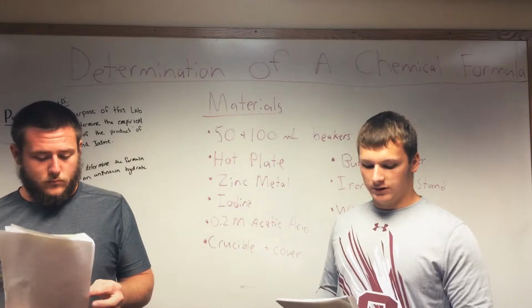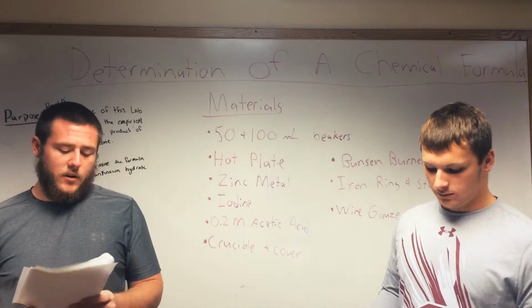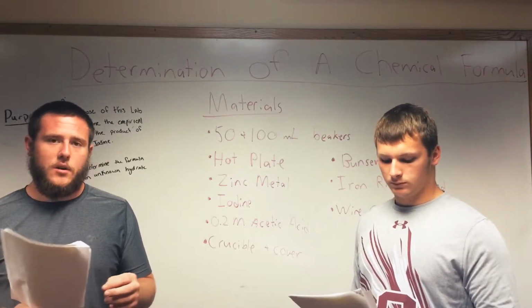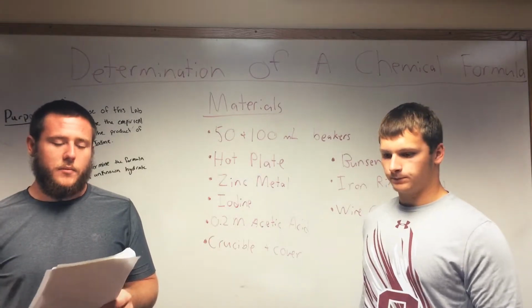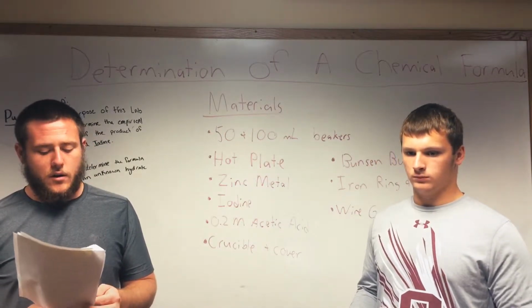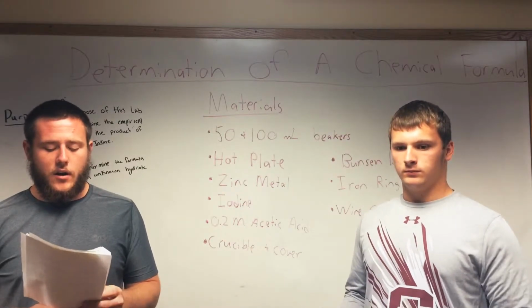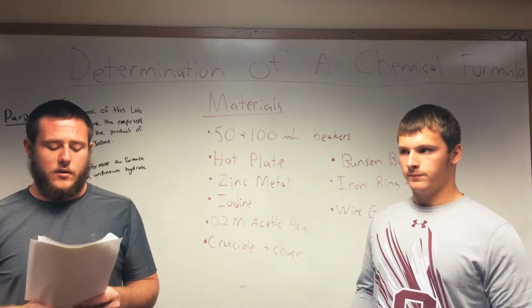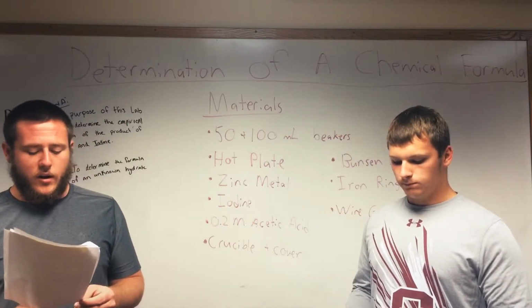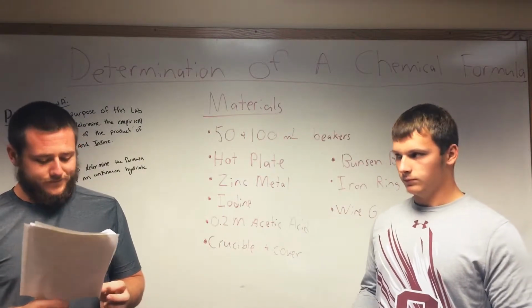After that, we had to pour 6 molar hydrochloric acid into a beaker. We dipped a spatula into the hydrochloric acid, and then we lit a Bunsen burner and put the spatula in the flame to make sure that the spatula was clean. Then we took a small amount of the unknown and put it on the end of the spatula, and then we put it up to the Bunsen burner, and if it turned bright red, we had strontium chloride as our unknown, but that wasn't the case.